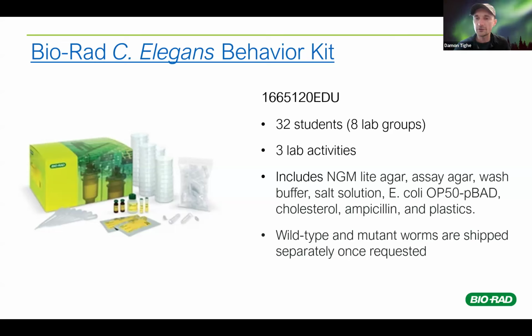Katie, you just asked, could you please repeat how the initial association of salt and food was made for the worms? Yeah. So the plates the worms are growing on have salt in them. As they're growing there, they are consuming E. coli and they're having that sensation of salt around. That's how we're getting that associative learning behavior to take place.